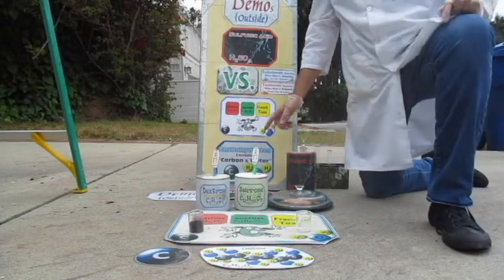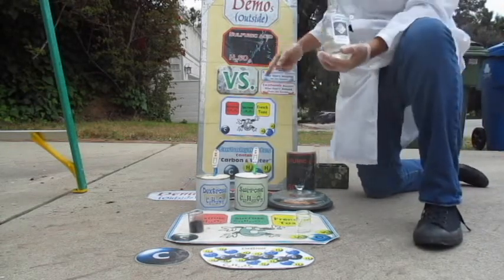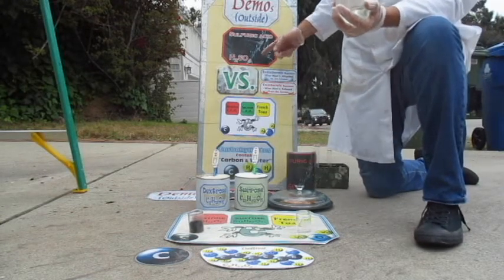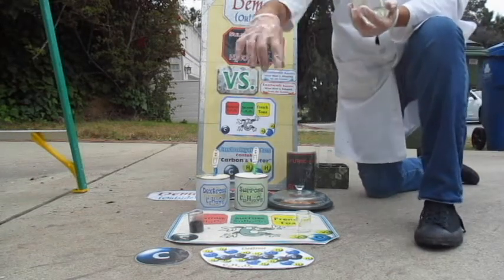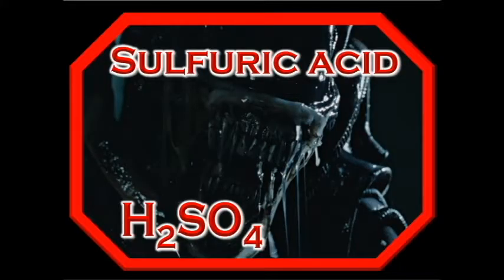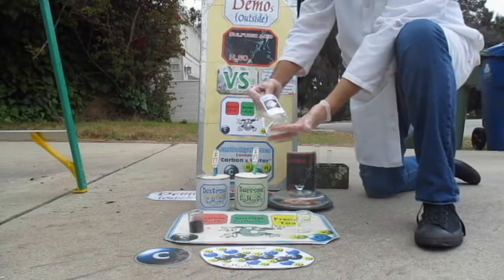We're gonna do that using a catalyst, sulfuric acid, which is a very nasty customer. I like to say it's like the drool from the Alien movies. It eats through the bulkhead of the ship. Very nasty acid. It produces nasty fumes. That's why my kids are not handling it.